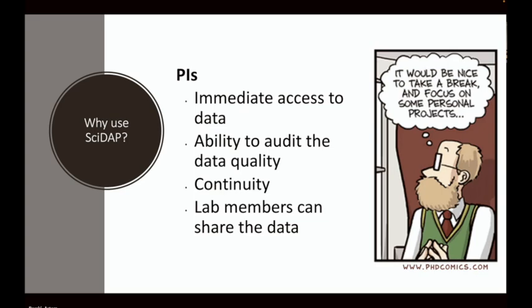There is continuity. So for example, if somebody leaves a lab, not only their data, but the methods that were used to analyze this data will stay in the lab, and you wouldn't need to reinvent the wheel. And it makes it easy for lab members to share the data.